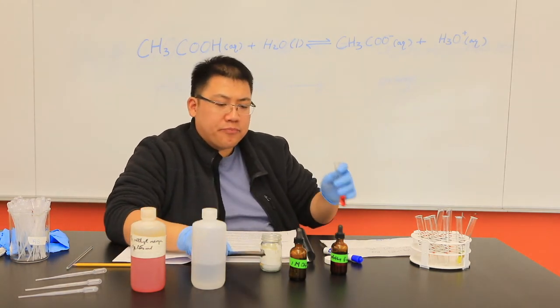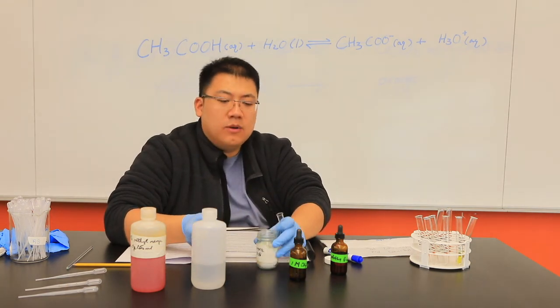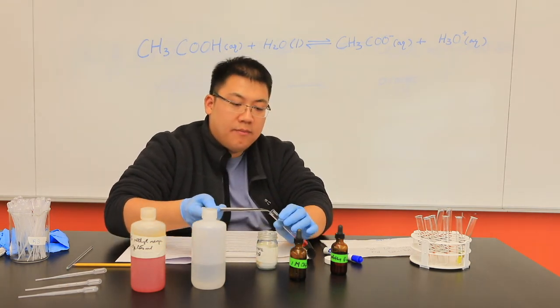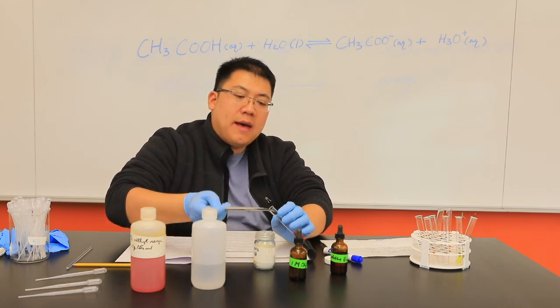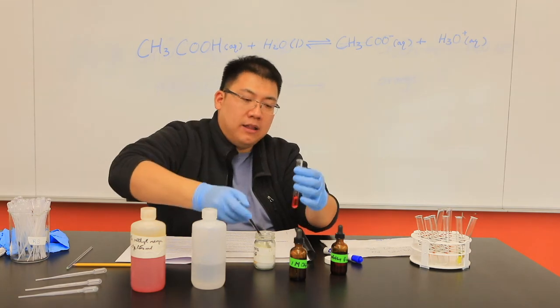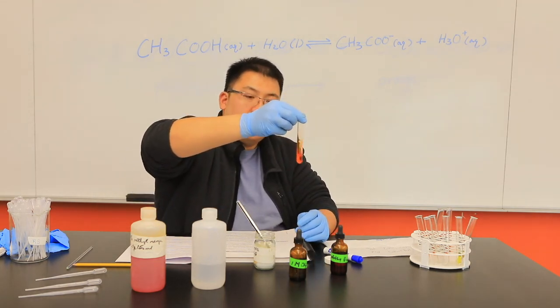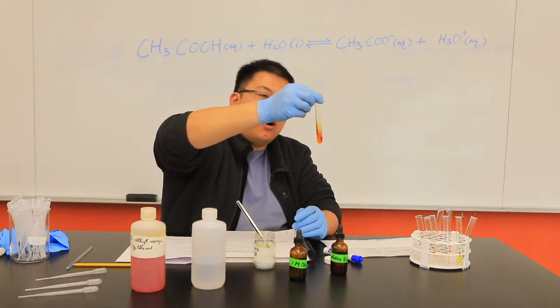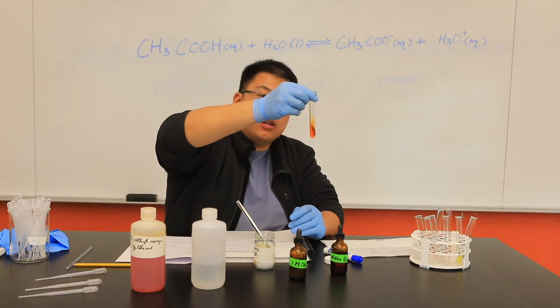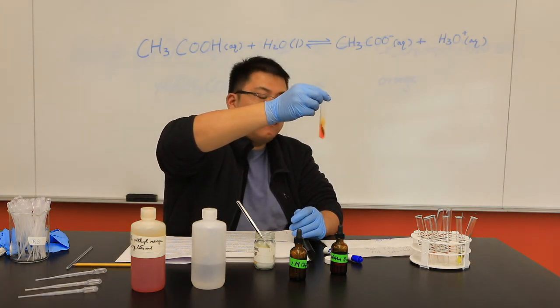And then I'm going to add some sodium acetate. Sodium acetate is an ionic compound that will fully dissociate in water. Let me mix it a little bit better until all of the sodium acetate dissolves in the solution. Then we're going to make another observation of it.